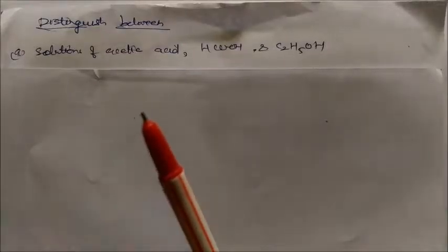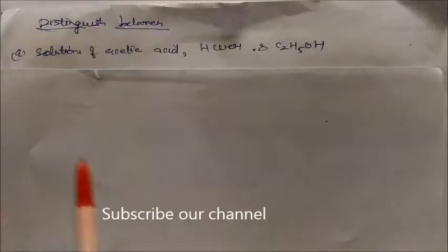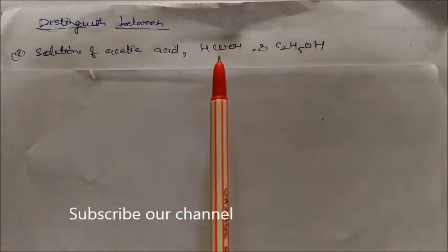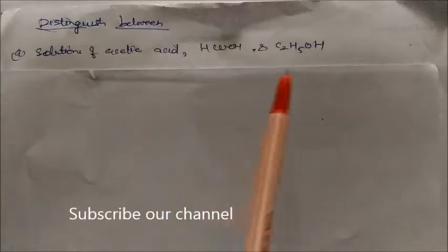So today in this session we will see how we can distinguish between the different types of carboxylic acid by using different types of tests. How we can do identifications. So we have three solutions: one is acetic acid, second is formic acid, and ethanol. Out of these, how can we distinguish these three?